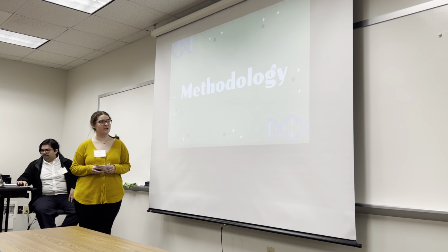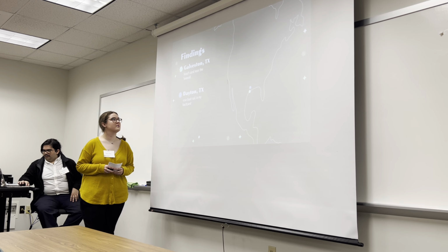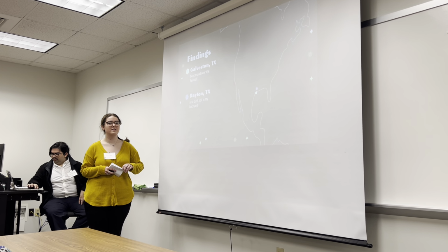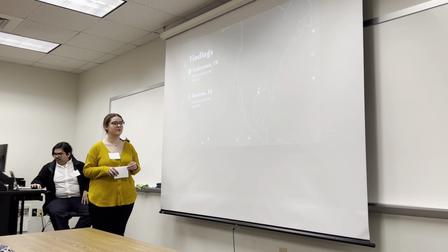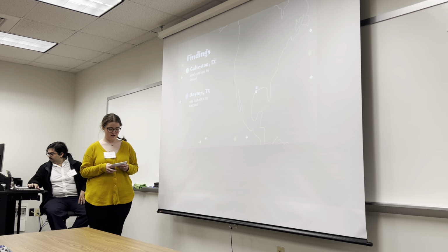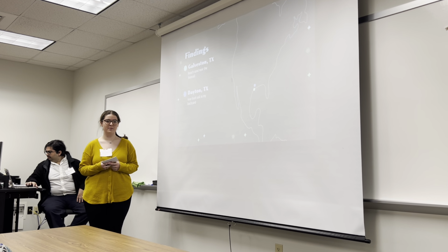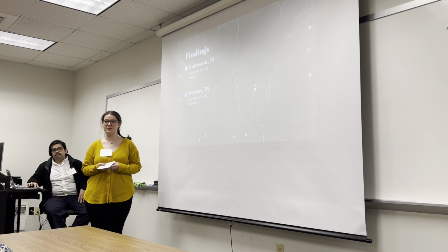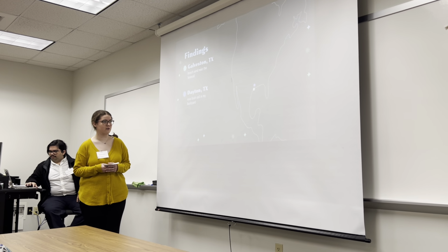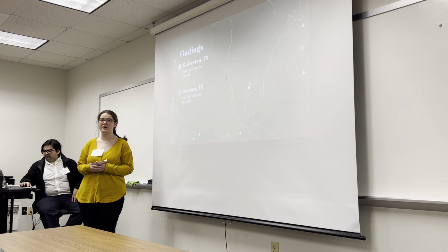So this is my methodology, which has quite a few steps. My first step was to get the soil. So I went to the beach at Galveston, Texas. I was near the seawall, and I had dug around 2 inches into the sand to get my collection. When I collected the soil samples, I recorded information such as the pH levels, the temperature of the air, the temperature of the soil, and the GPS coordinates of the findings. And then I also got some soil from a rose bush in my backyard in Dayton.